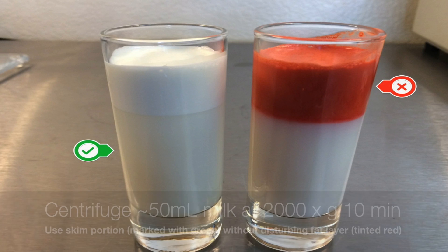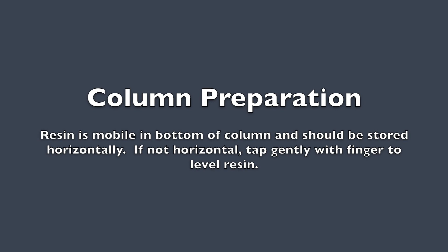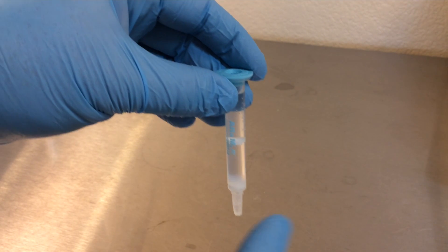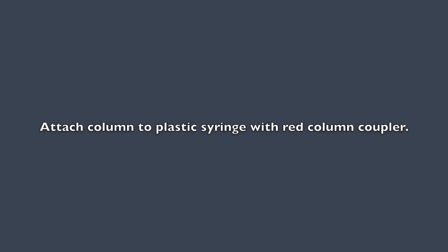Prepare your sample by centrifuging approximately 50 milliliters of milk at 2,000 times gravity for 10 minutes. Carefully remove the skim portion — the bottom layer of the milk — for analysis without disturbing the top fat layer, tinted red here for emphasis. You'll need 40 milliliters of skim milk for each affinity column. The resin in the column is mobile at the bottom and should be stored horizontally. If it's not horizontal, tap gently with your finger to re-level the resin.